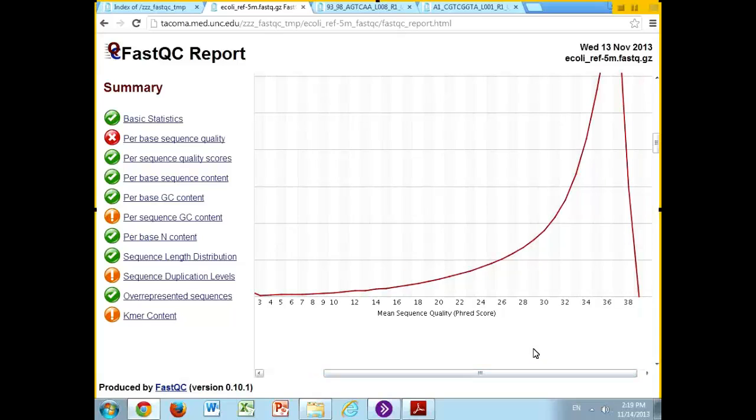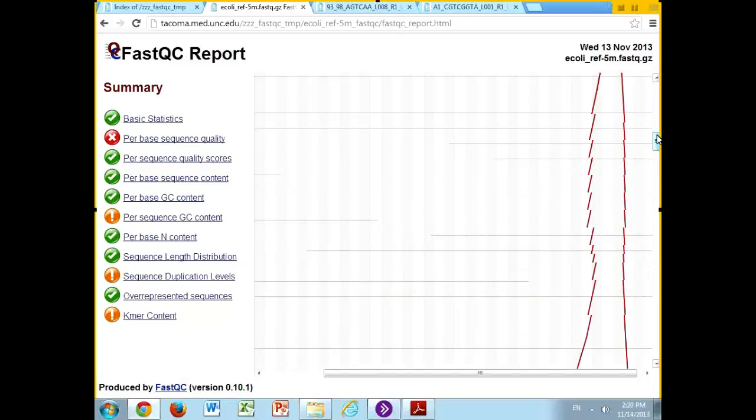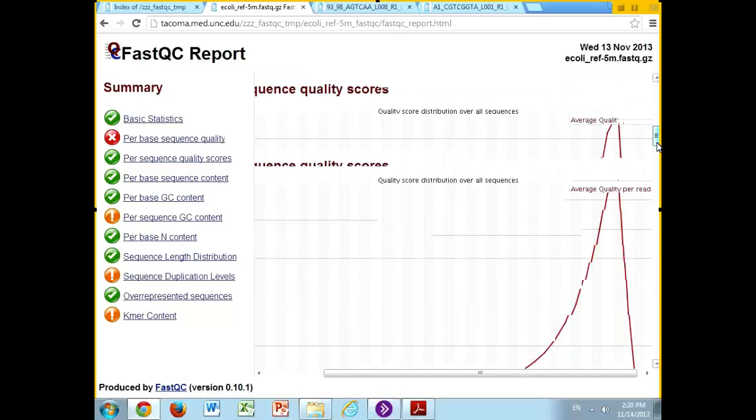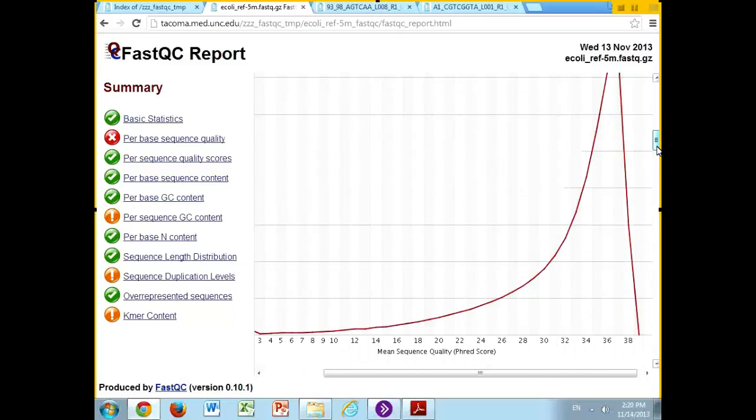This graph is not per base pair, so the first one was statistics over the very first base pair in all possible reads, second base pair. This is per the entire read—what is the average score of an entire read? You can see here that the vast majority of reads, their average score is between 35 and 38. That's great.